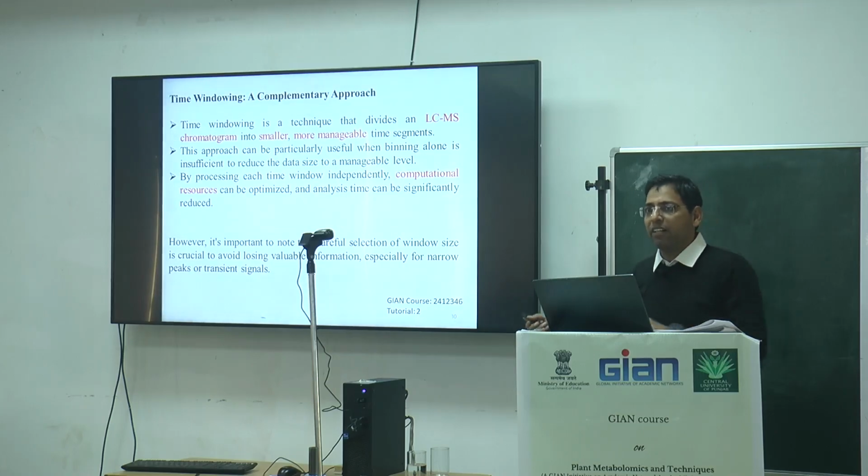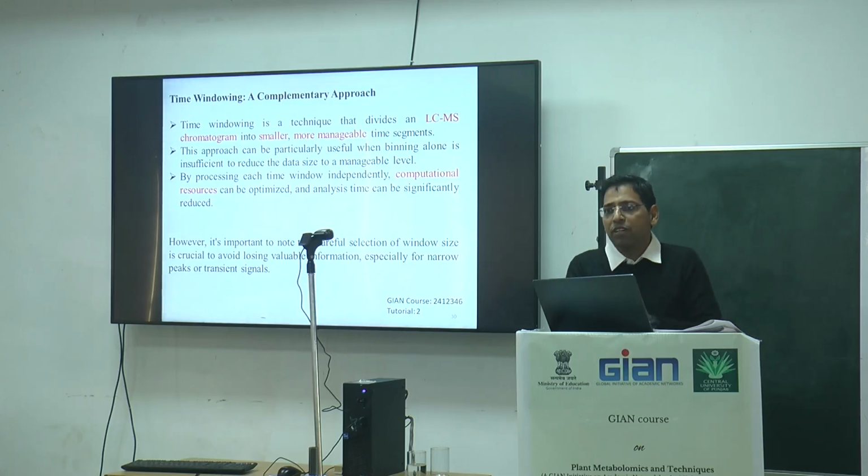However, it is important to note that the careful selection of the window size is the most important thing to avoid any loss of valuable information. If you use any window size carelessly, you might lose meaningful information in those areas. So we have to optimize this, sometimes this window, next time that window, and you will find out which particular window period gives you your analytes or not. So you have to optimize this according to your own experiment.